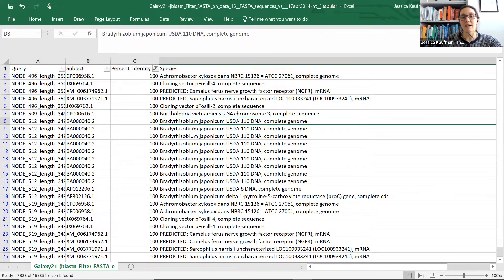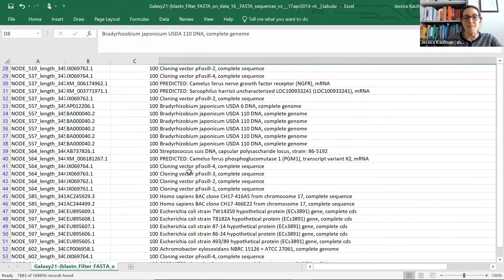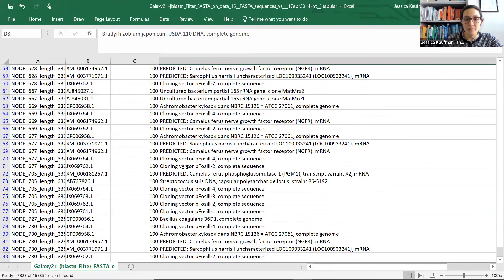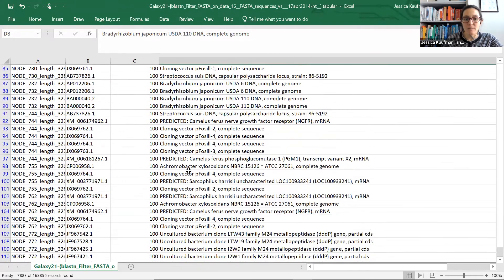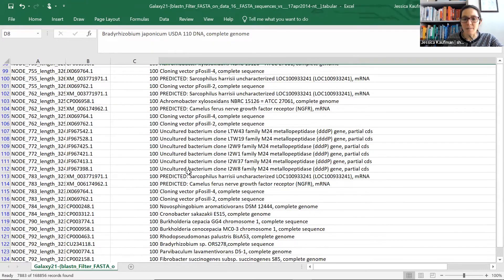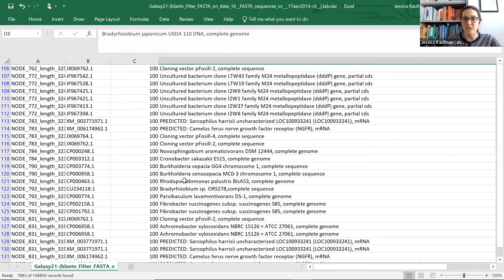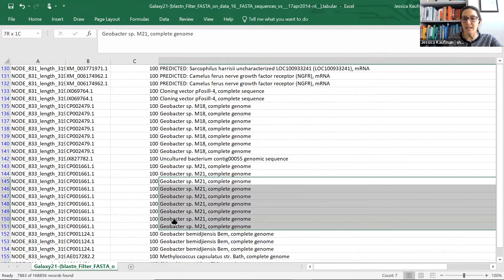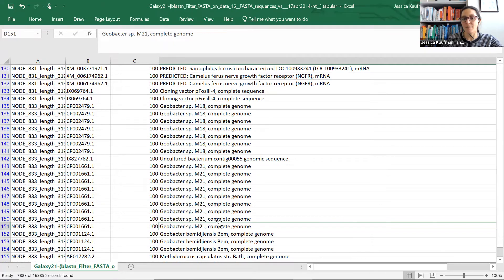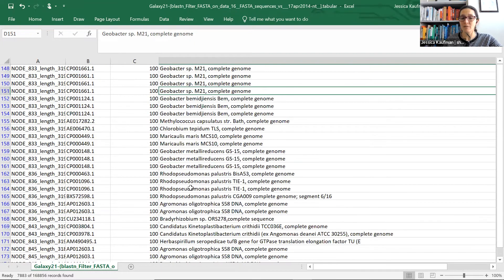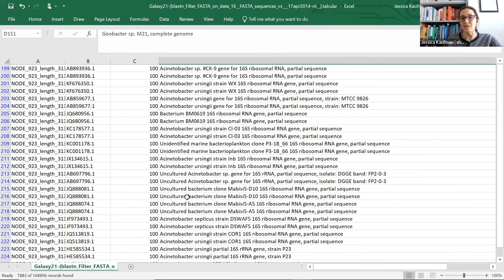So Bradyrhizobium japonicum USDA is something that comes up a lot of times. We also have a complete genome that comes up for a couple of other species. This Geobacter sp. is another one that comes up with a complete genome. So either of these would be acceptable for you to select as the genome that you are going to map to. You just decide, as a researcher, which one you want to try.